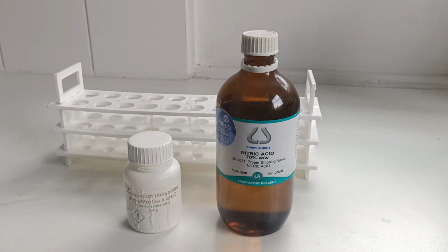I'm Toby and today I'm doing a fairly simple phosphate test for testing phosphates in minerals and rock samples. Quite a handy little test for fossickers and prospectors, geologists, the mineral collectors.